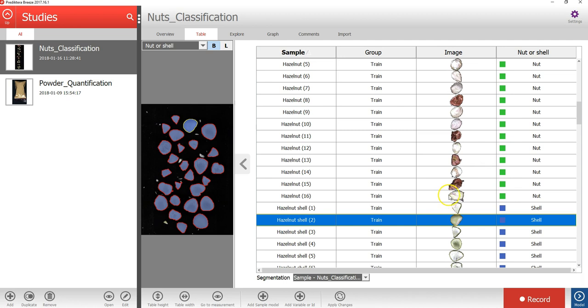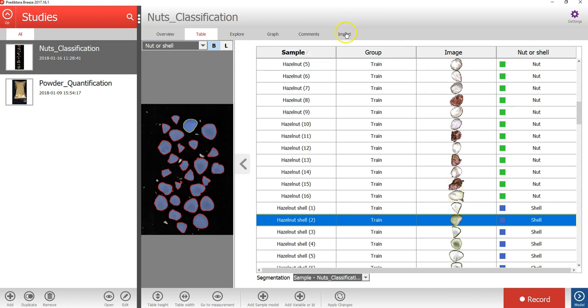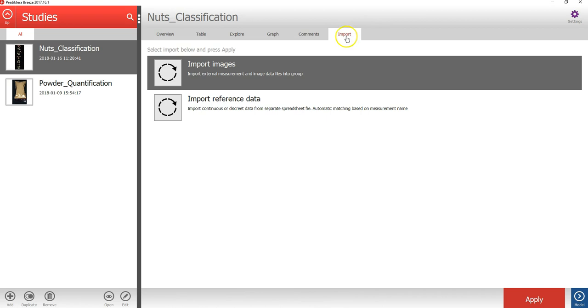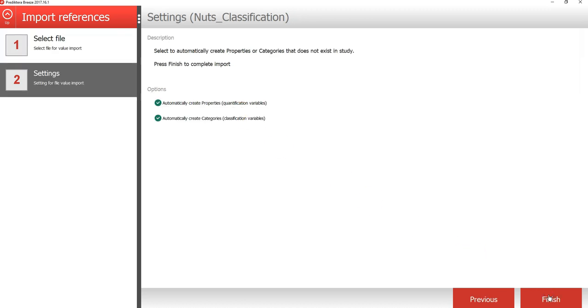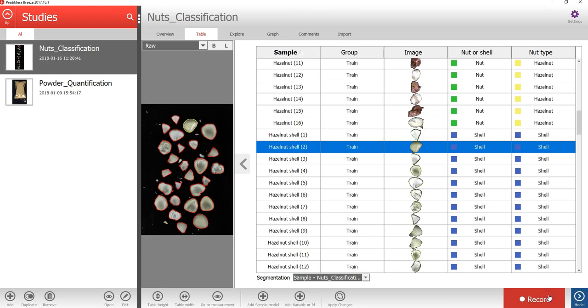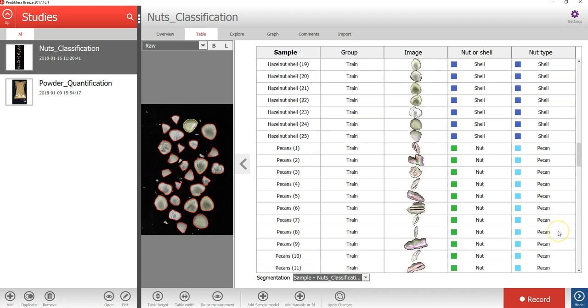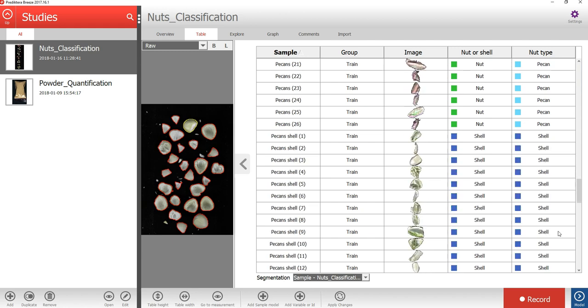Now let's add a new class variable and import reference information for the nut type for each sample. To do that, I will press the import tab, select to import reference data, I will select the file called nut classification train. In the table view, you can see the nut type class variable that was imported, and the reference values have automatically been matched to the correct sample objects.